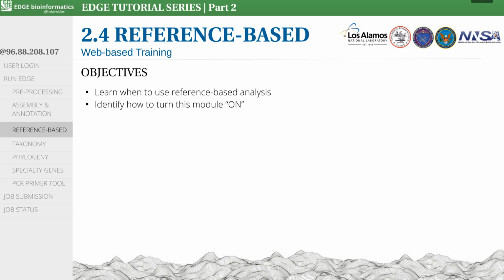This video will demonstrate use cases for the reference-based analysis module in EDGE. After this tutorial, users will know when to turn reference-based analysis on and how to select parameters for this tool.